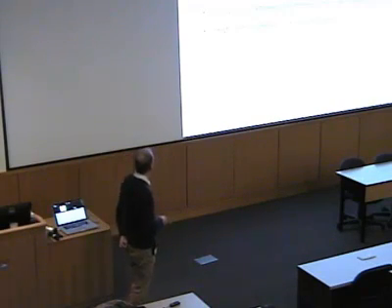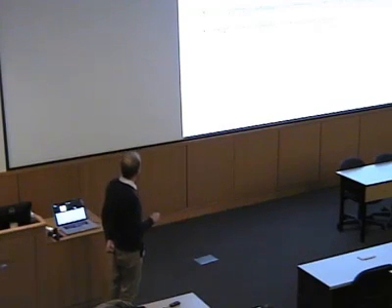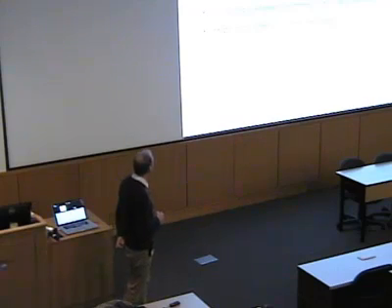The method is a little different than many other spectroscopic techniques. There are some peculiarities to EPR, and so I'll try to show you why those are necessary or how we do the experiments. And then we'll start talking about various different interactions which are important. A very important one is the hyperfine interaction.